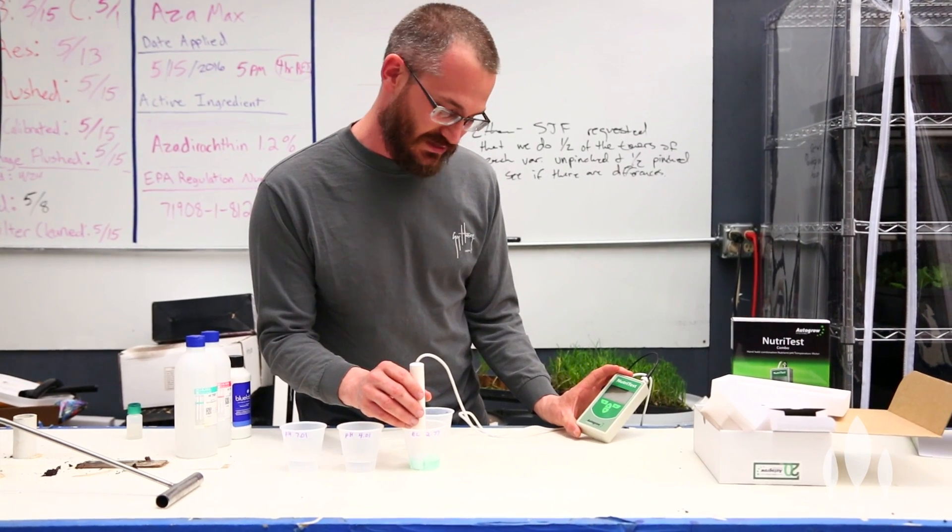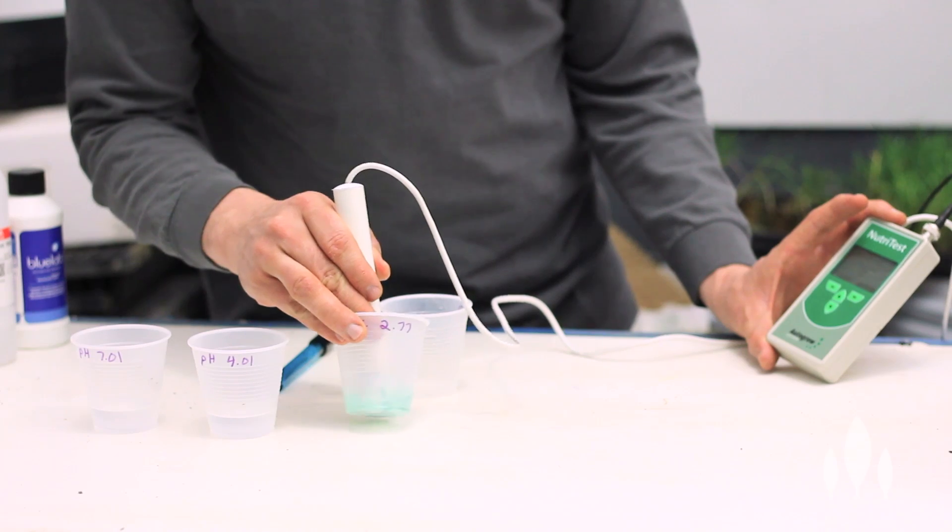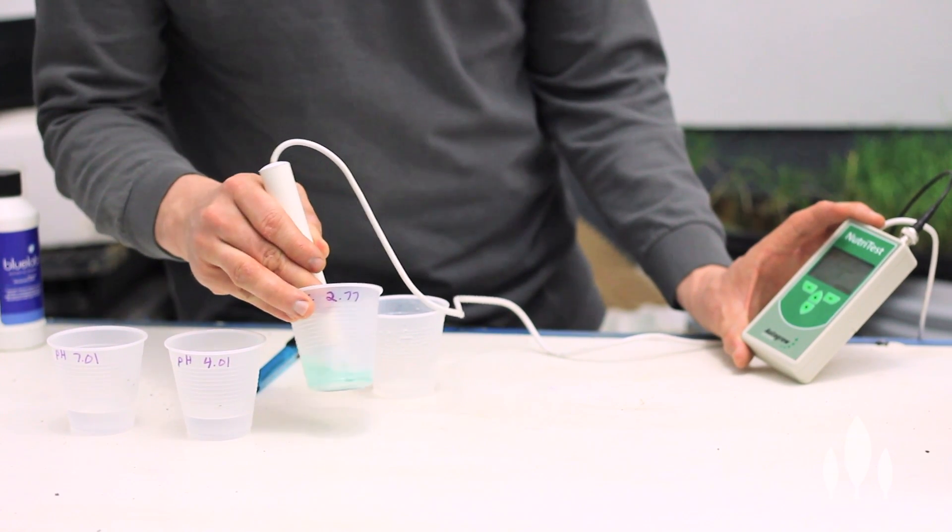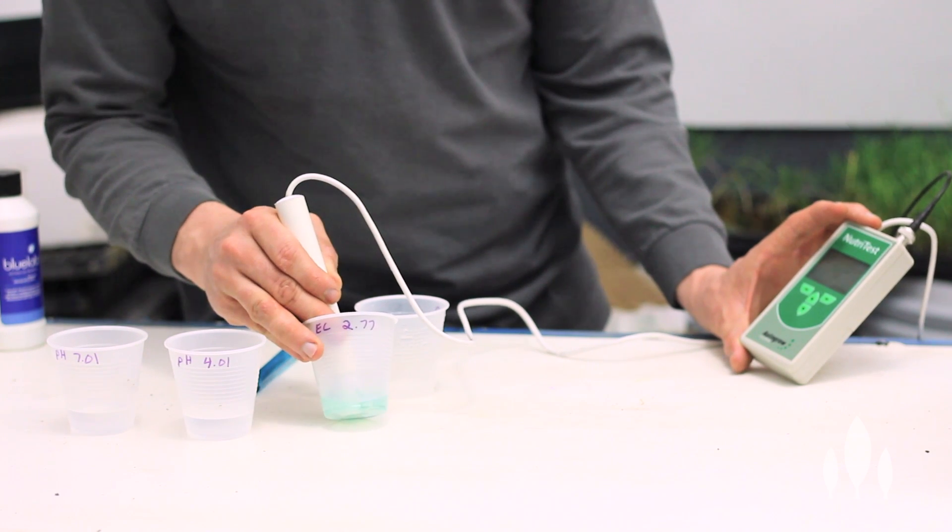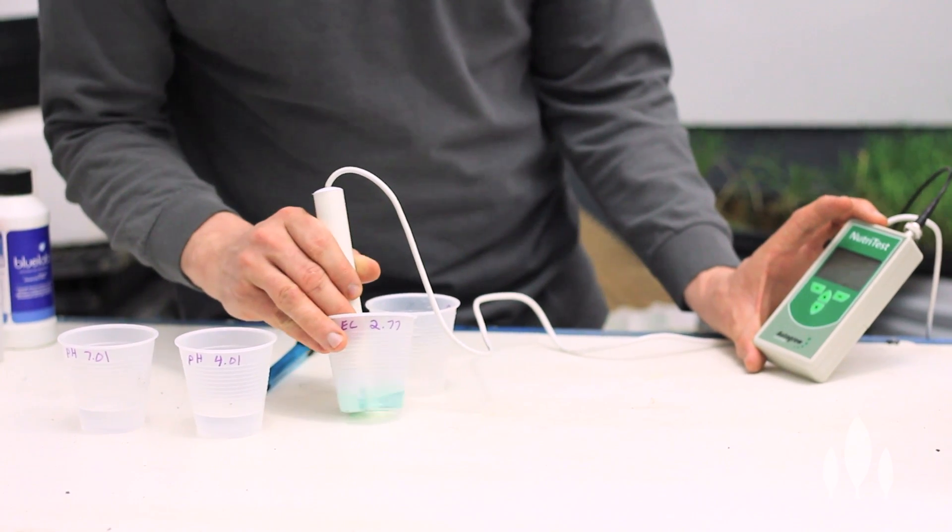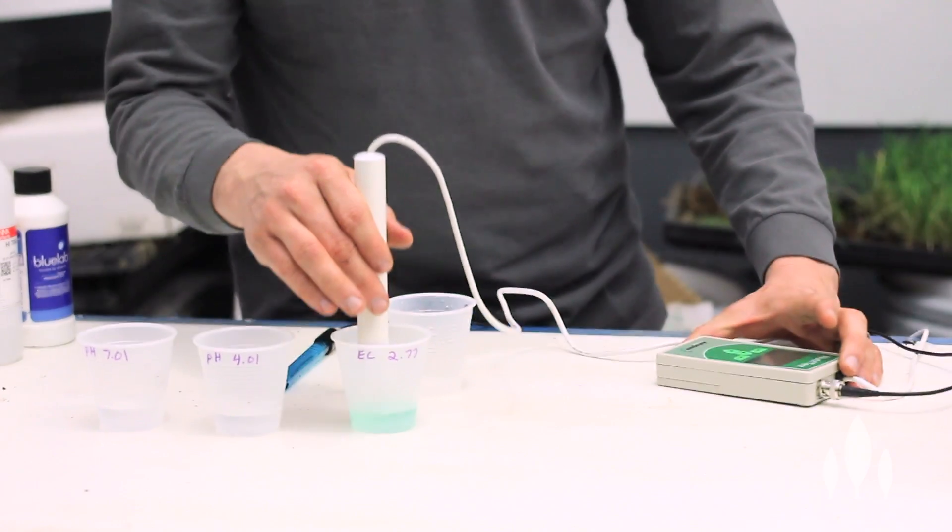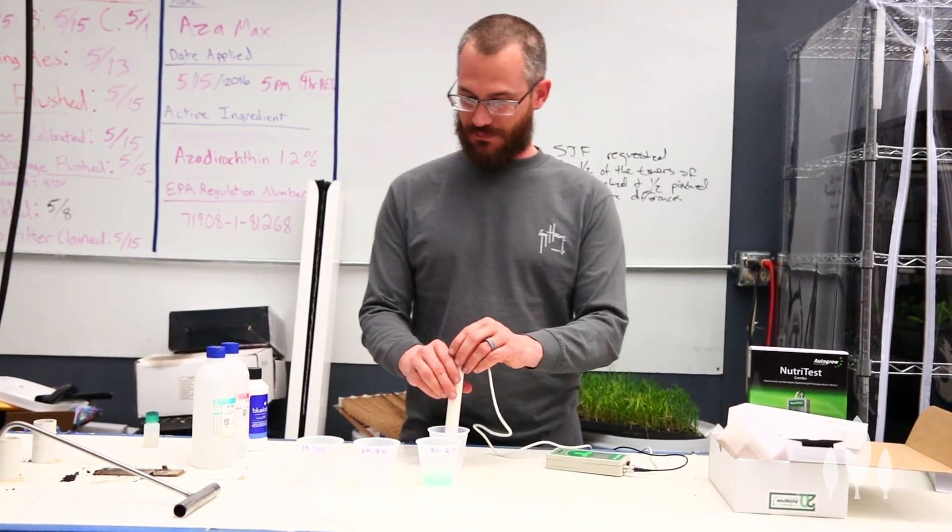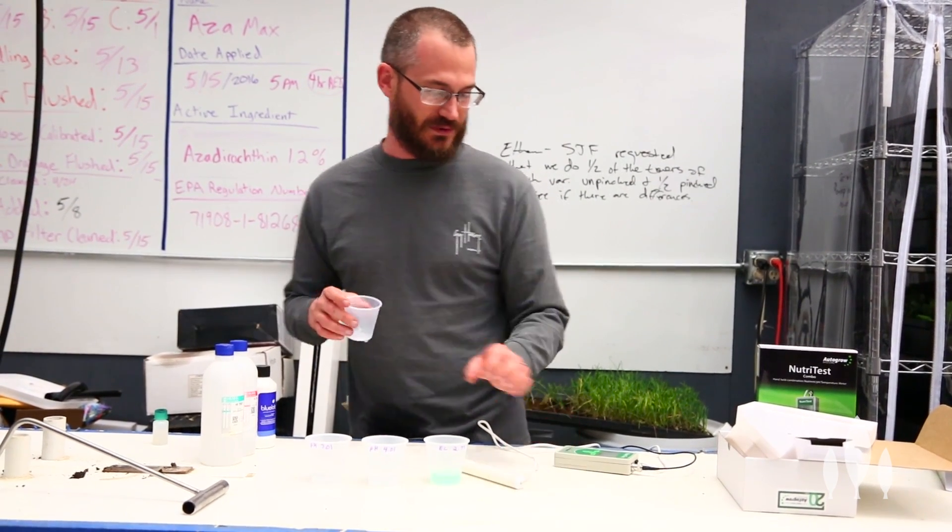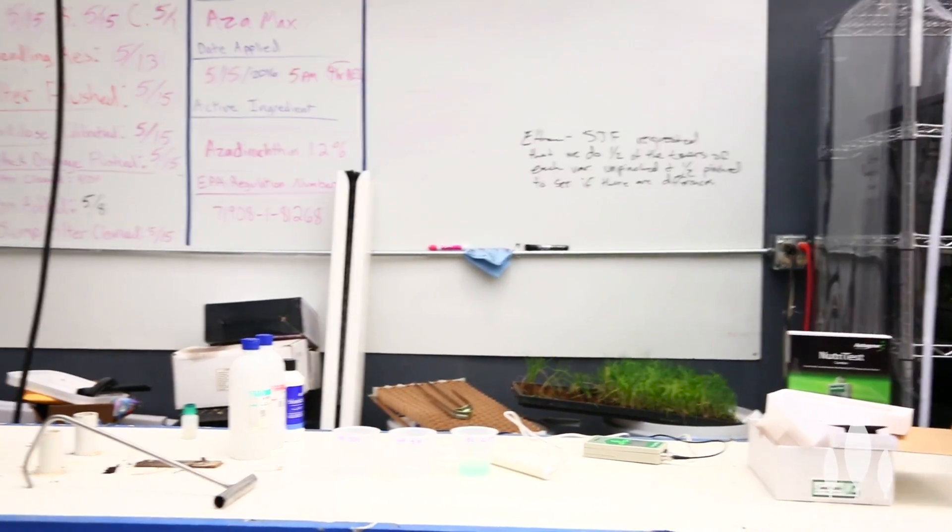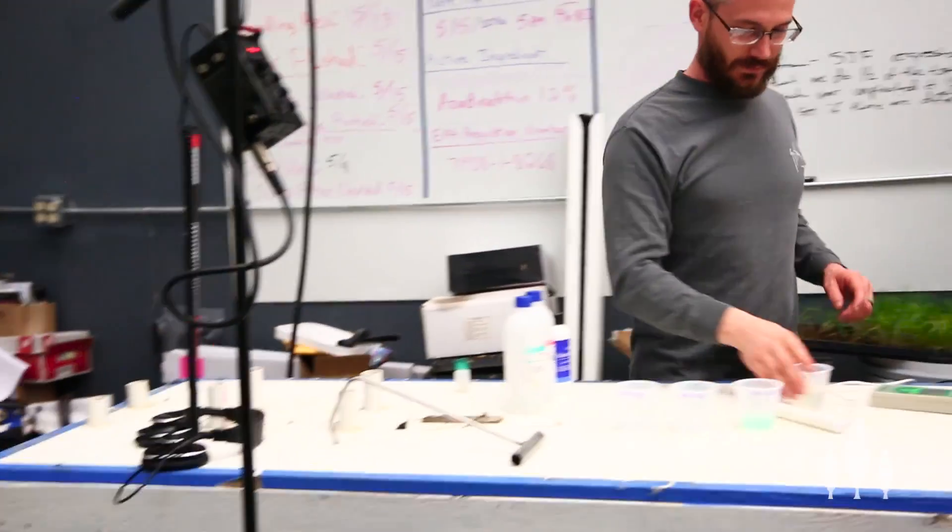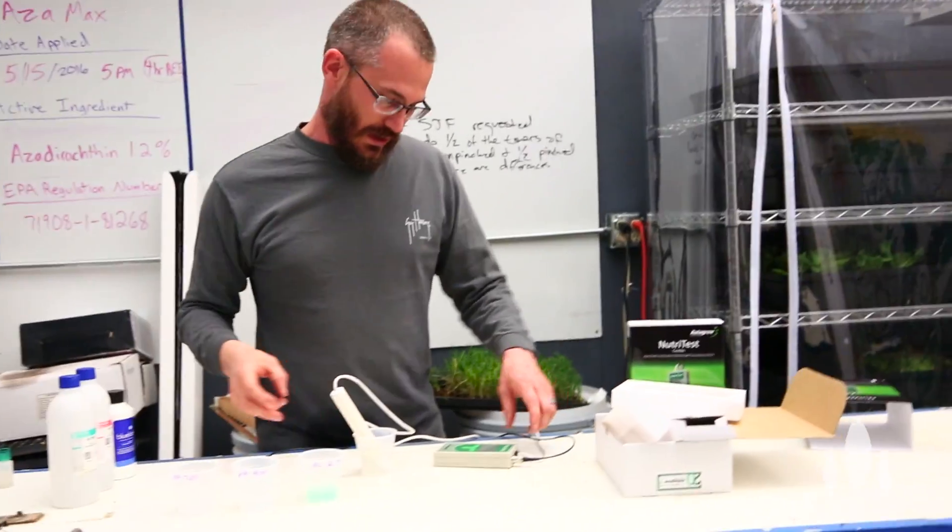So it tells you to wait now 20 seconds. You just have to keep that little probe in there. Make sure it's under the surface of the solution. I'm kind of skimpy here because I don't like reordering this stuff very often, but just make sure it stays in there. It's in the solution. It's measuring. And you're going to wait until it counts down. 3, 2, 1, calibration complete. So, that's done, and I'm going to grab a little bit of water right now just to make sure that I can keep these things dry after I calibrate them. So, that's EC.